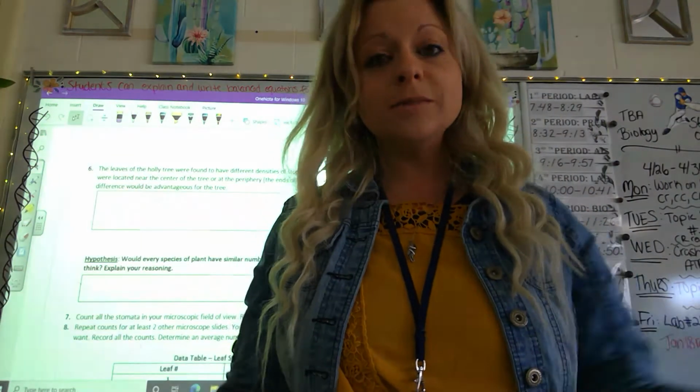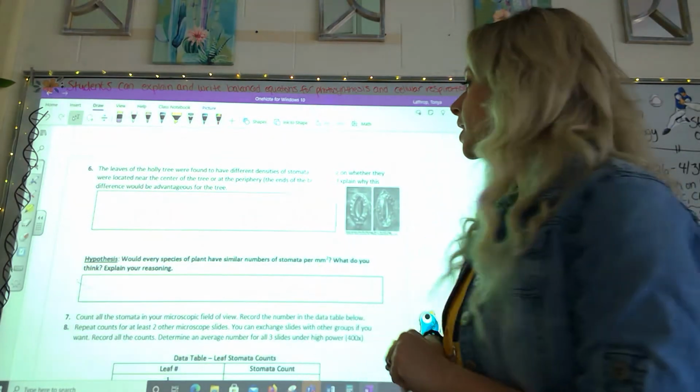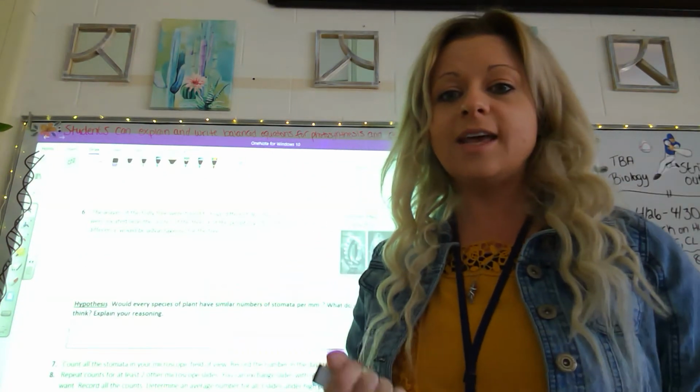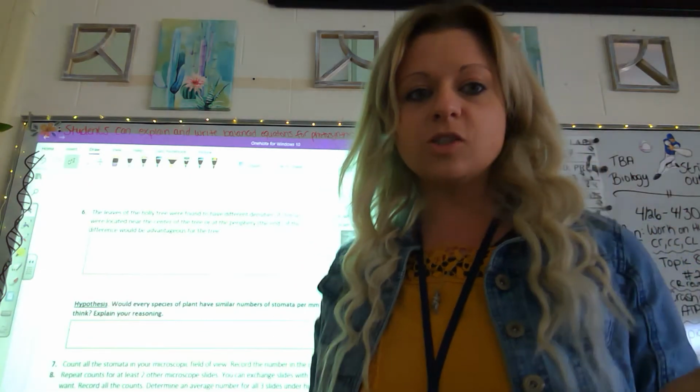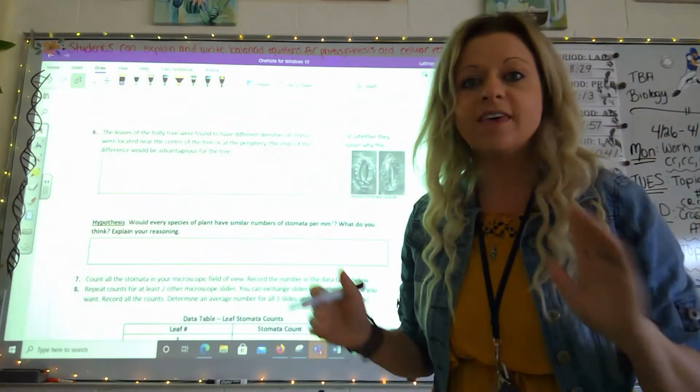So welcome to Virtual Lab 21, the Stomata Lab. I am going to go over the entire lab, start to finish, to help you guys at home so you can turn in and we can then proceed and finish Lab 21 this week. So as long as you're watching this video and filling in all the questions and data, then we should be all set.